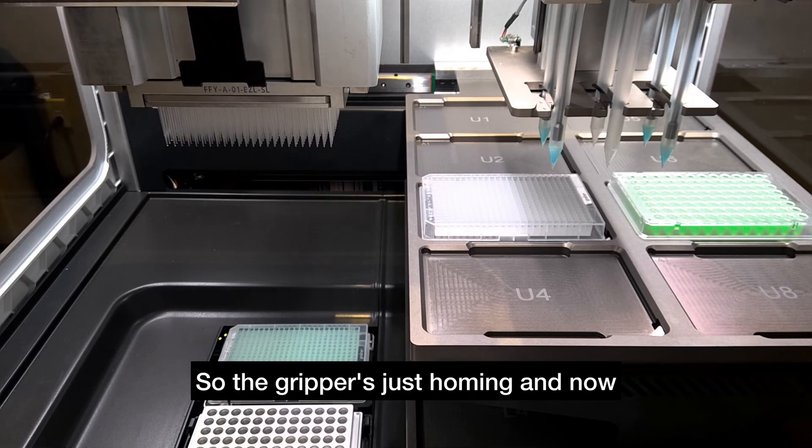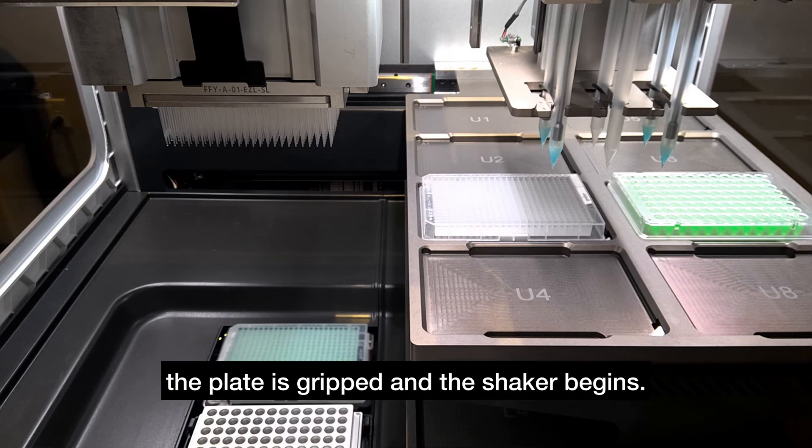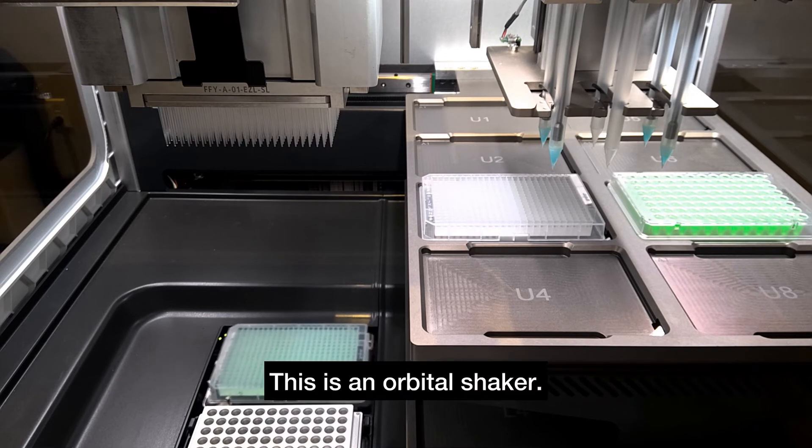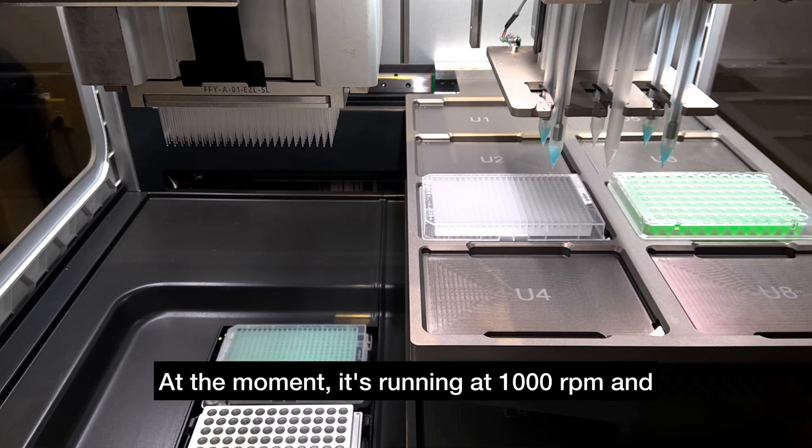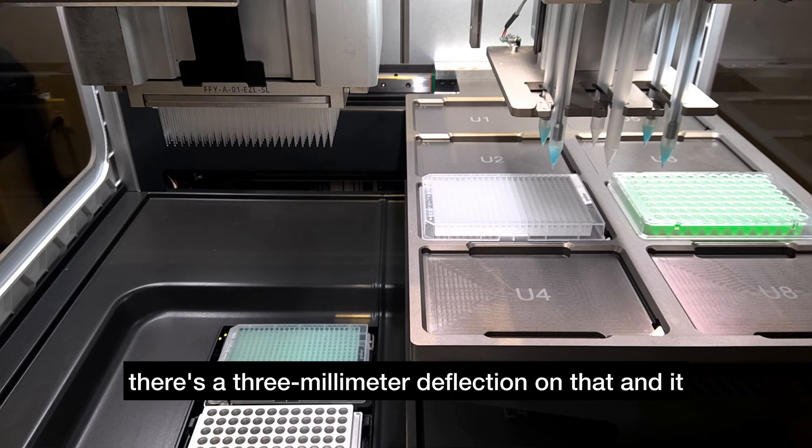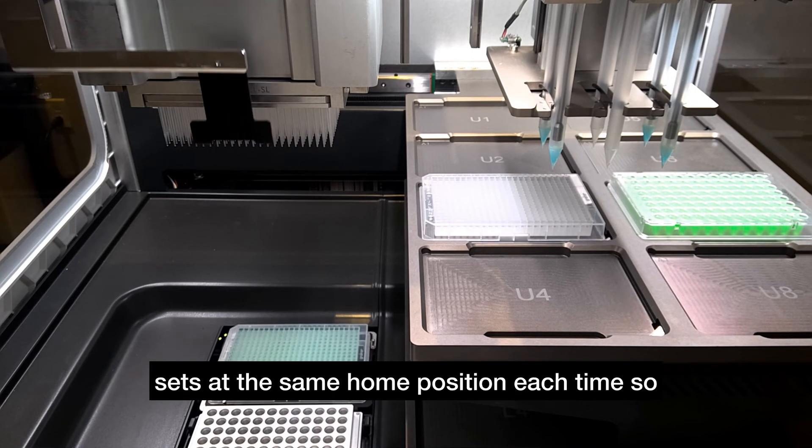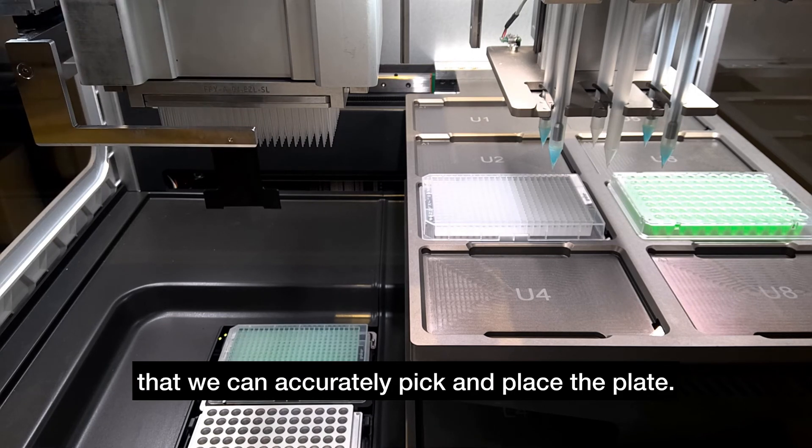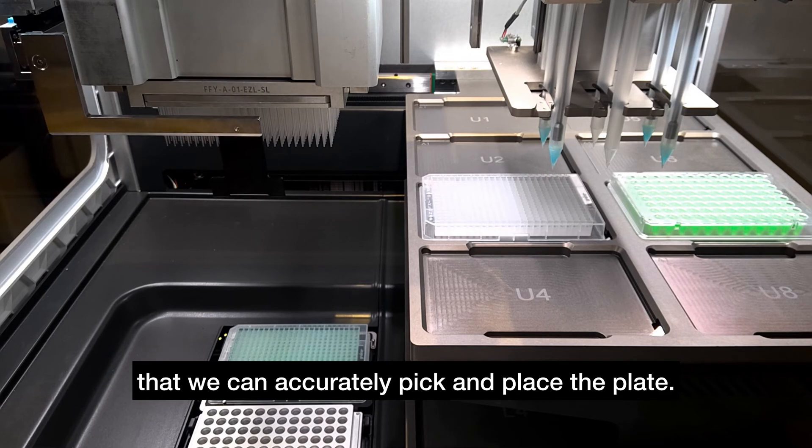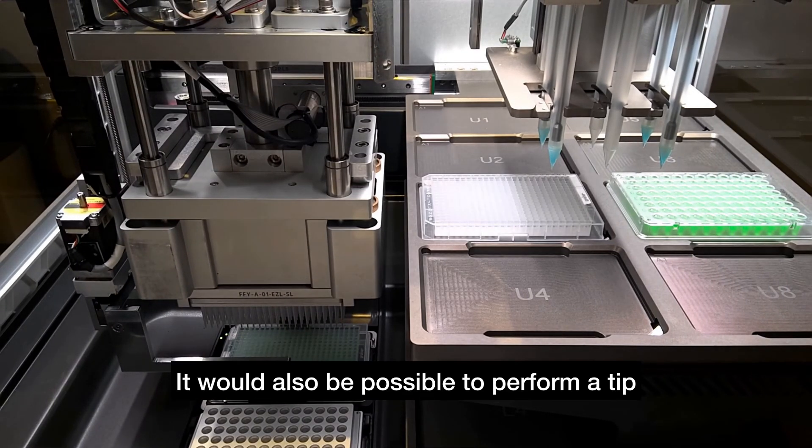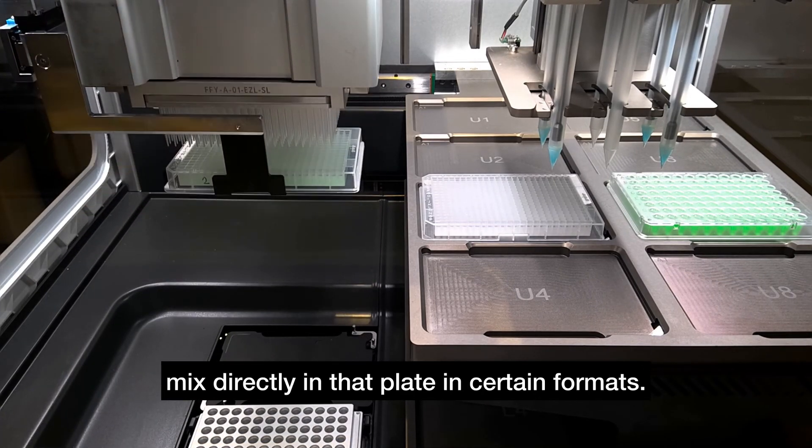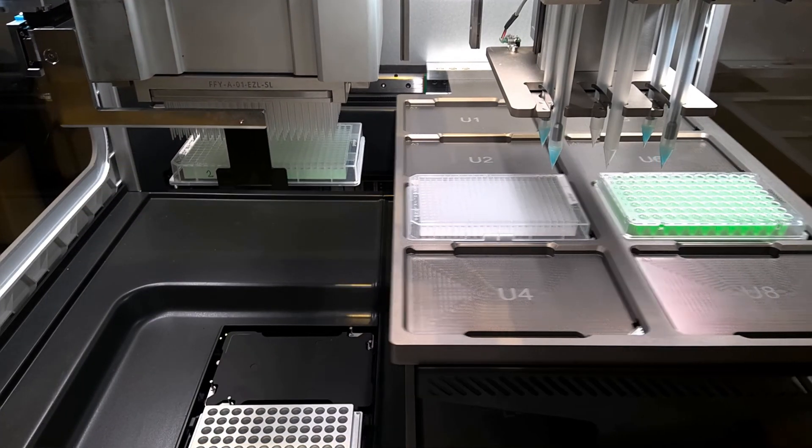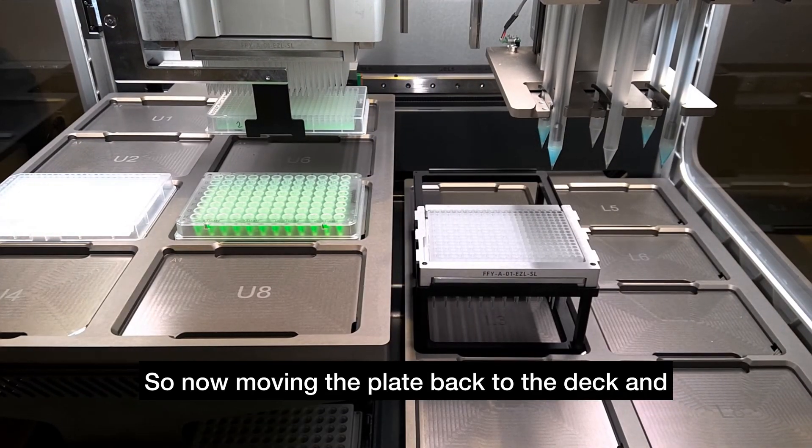The gripper is just homing and now the plate is gripped and the shaker begins. This is an orbital shaker—it can go up to 3000 rpm. At the moment it's running at 1000 rpm with a three millimeter deflection. It sets to the same home position each time so we can accurately pick and place the plate. It would also be possible to perform a tip mix directly in that plate in certain formats. Now moving the plate back to the deck.